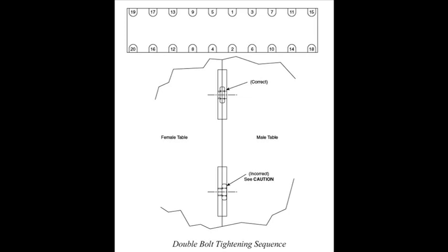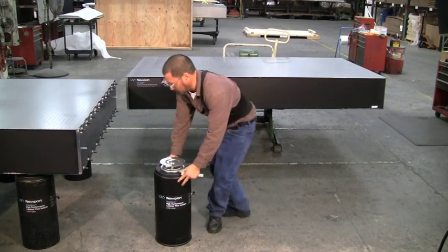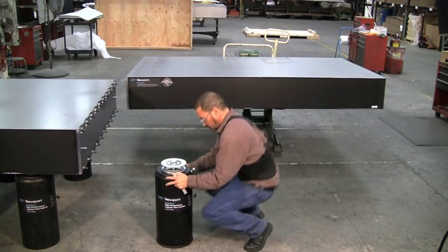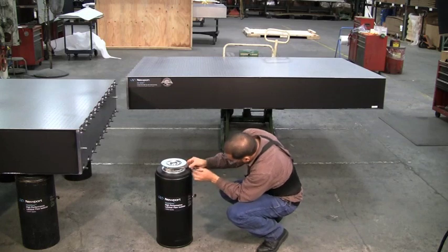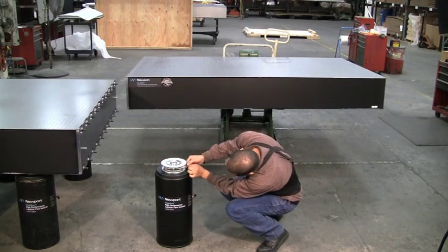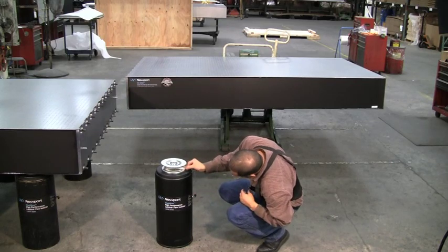This will help guide the order in which the bolts should be torqued after initial hand tightening to ensure uniform mating and reduce the risk of improper alignment. Position the set of table isolators or legs near their final installation position to temporarily support the table section. It is recommended that this set of legs also be adjusted to slightly below their mid-height position to allow adequate height adjustment range for final system leveling.